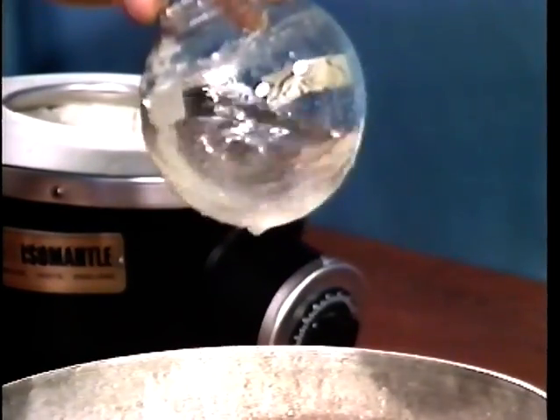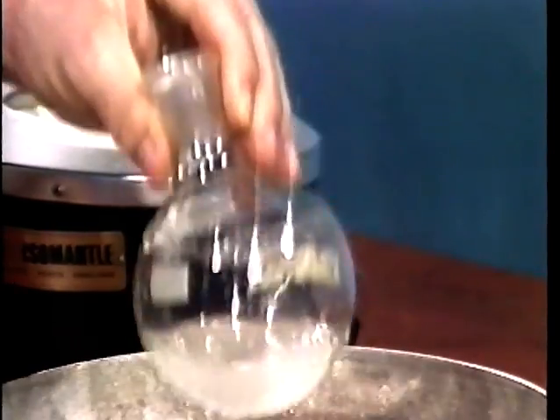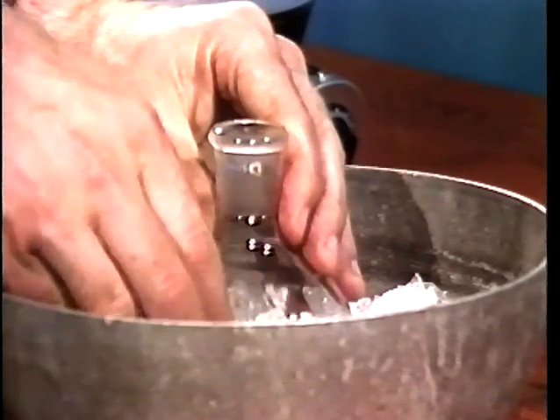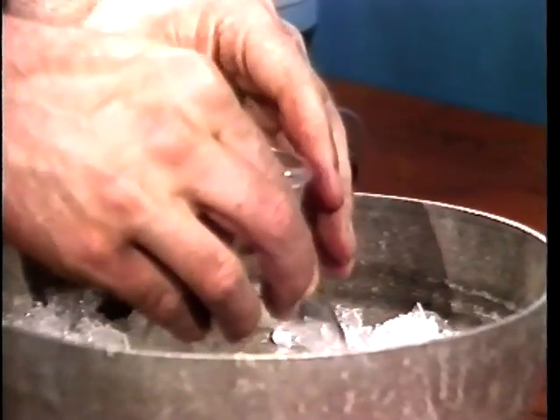Once crystallization starts, leave the flask in the ice bath in order to complete the process. It will be necessary to clamp it to prevent it falling over.